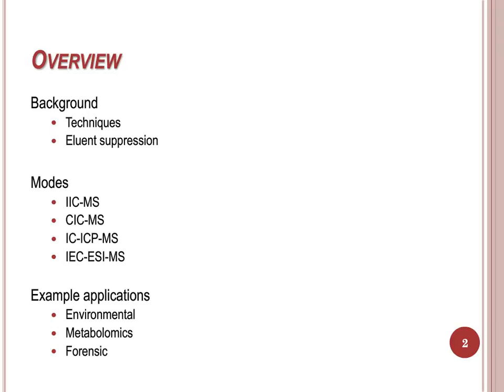I will then discuss the different modes of ICMS, including ion interaction, chelation IC, IC coupled to inductively coupled plasma MS, and finally ion exchange. Throughout the presentation, I'll include several applications to provide examples of these modes and to highlight the potential ICMS has in a number of fields.